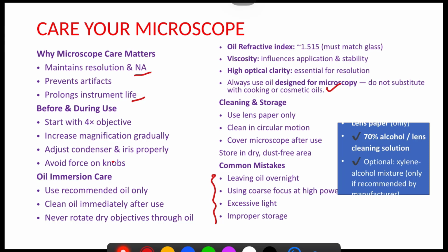These are the things about how you know your microscope, and what you will see when you purchase your personal microscope, right? And I hope you now find microscopy easy when you purchase the microscope according to this guide.